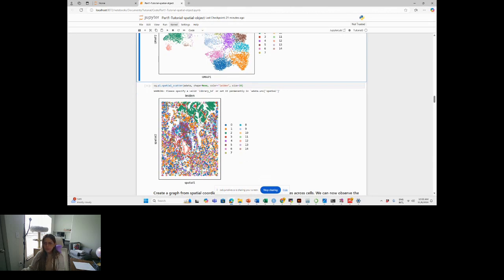Right now, we gave a color to each cell. And in this plot that we see here of the spatial transcriptomics, each dot corresponds to a cell, the original cell in the slide of tissue that we obtained for this analysis. In this case, the data set is for lung cancer, right? Yes, non-small cell lung cancer. So since they have some samples from tumors of non-small cell lung cancer, we expect that they provide, as part of the cell types, some cells that are classified as tumor cells.